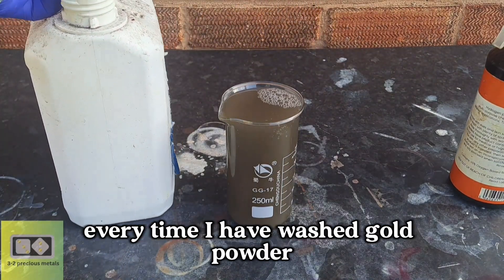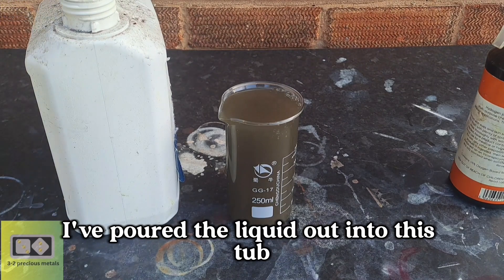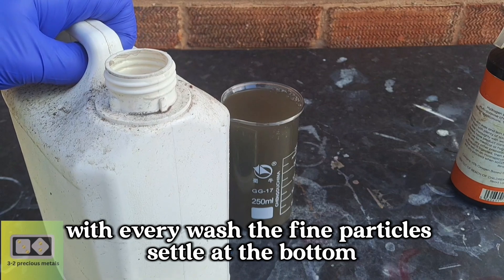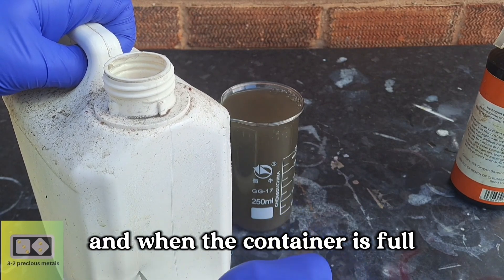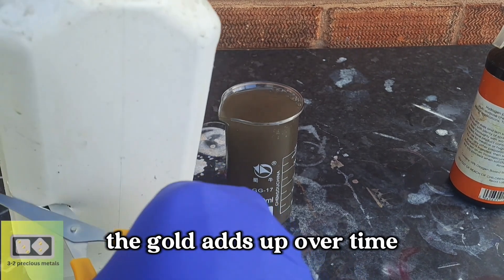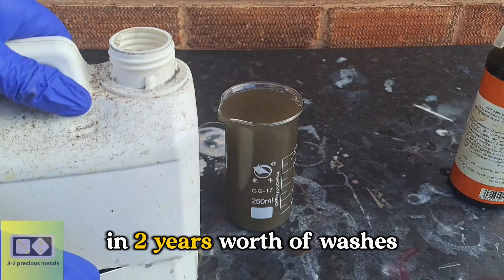Over the past two years, every time I have washed gold powder, I've poured the liquid out into this tub. Small particles get carried over with every wash. The fine particles settle at the bottom, and when the container is full, the liquid gets siphoned into the stock pot. The gold adds up over time, and today I'll see how much gold has collected in two years' worth of washes.